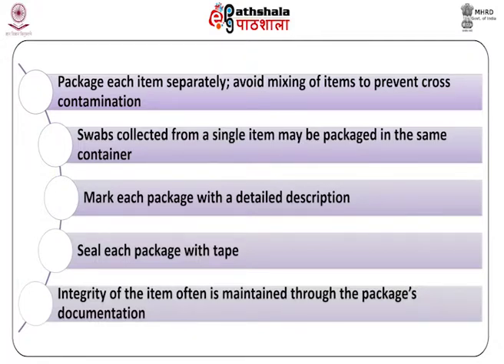Seal each package with tape. Staples are not considered a proper seal. All seals must be marked so as to identify the person making the seal. Mark through the seal with name or initials and date.